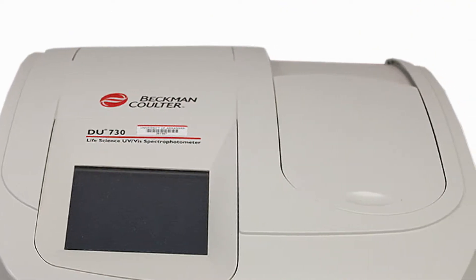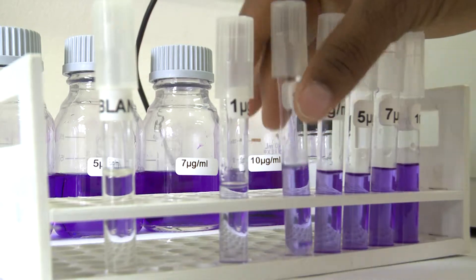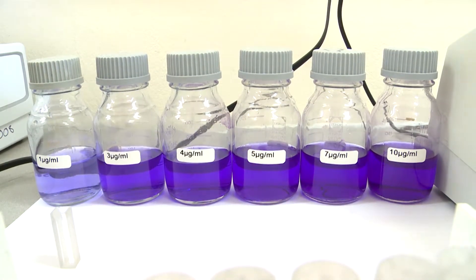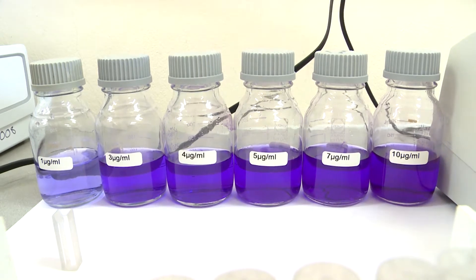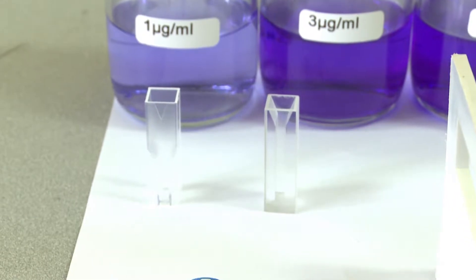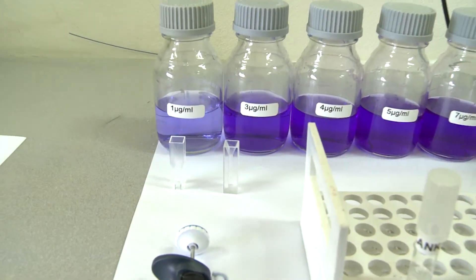Before using the DU730 spectrophotometer, you must make sure you have all of your apparatus in place. Today we have our sample solutions in the background from 1 to 10 micrograms per mil of crystal violet. We also have our cuvettes, which is one form of a sample container. Make sure you have clean cuvettes or test tubes. We have the plastic ones, which are used for the visible spectrum.